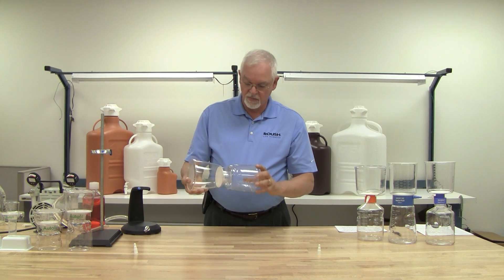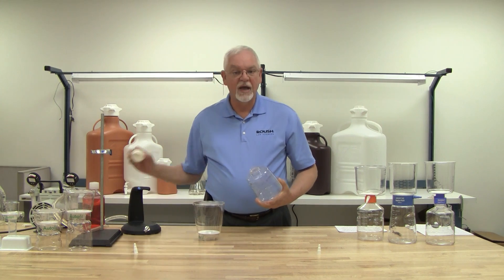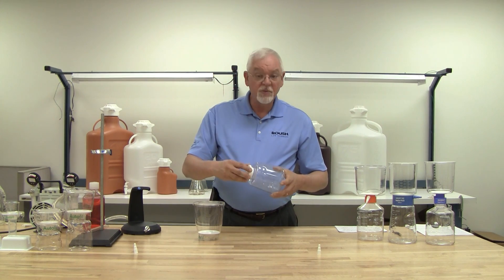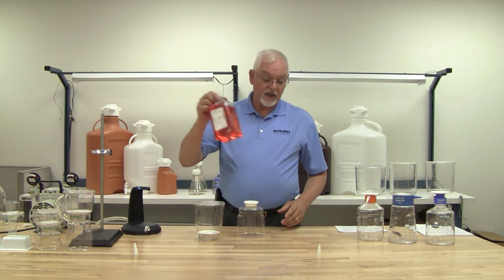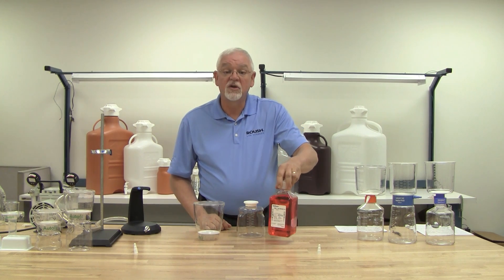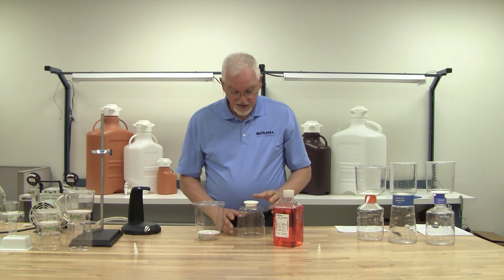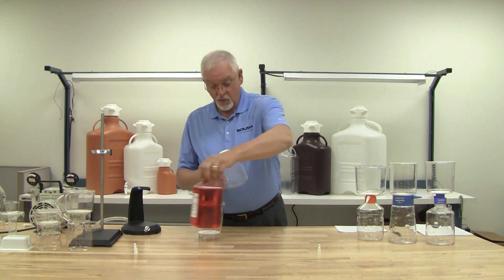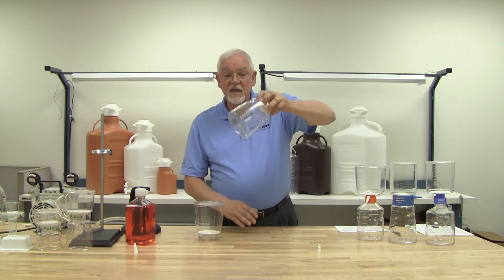The receiver bottle comes with our patented secure grasp cap. Why is that important? Because our focus groups told us that lab personnel have a tendency to want to carry the product with just their fingers, and occasionally with gloves they can drop the product. So what we did was create a lip around our cap, making it very easy to carry.